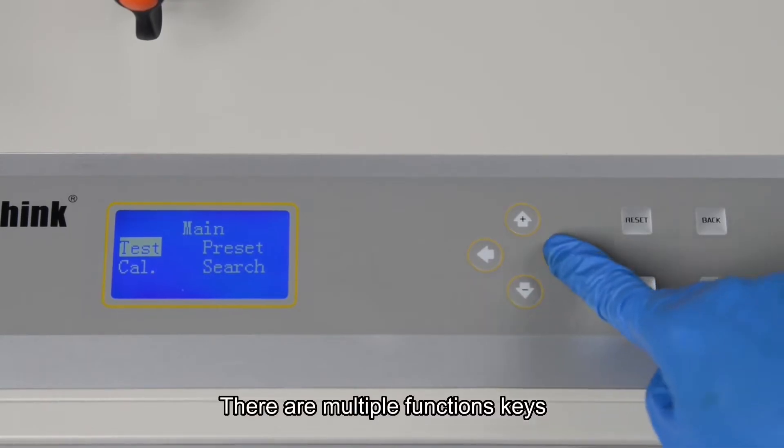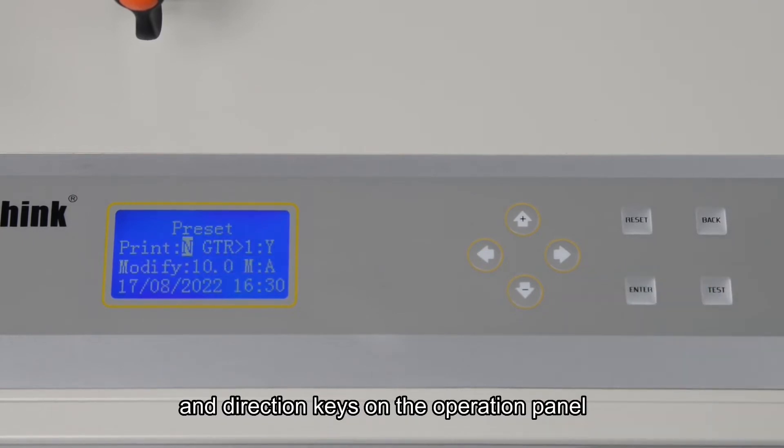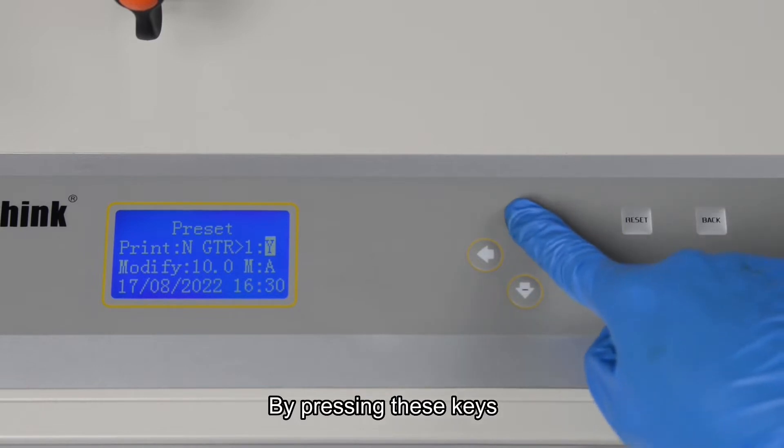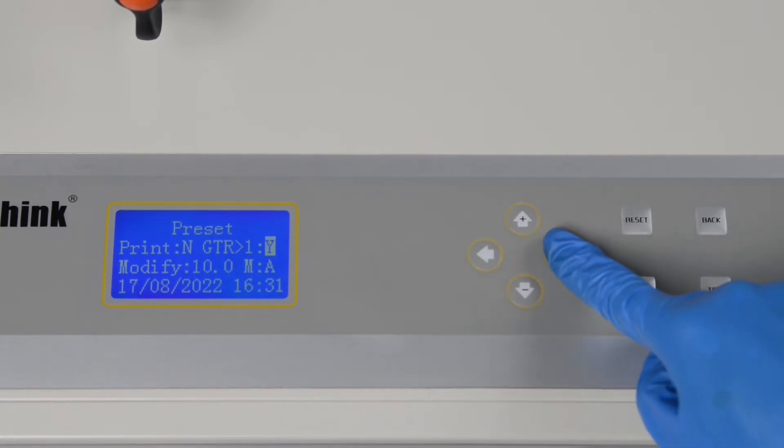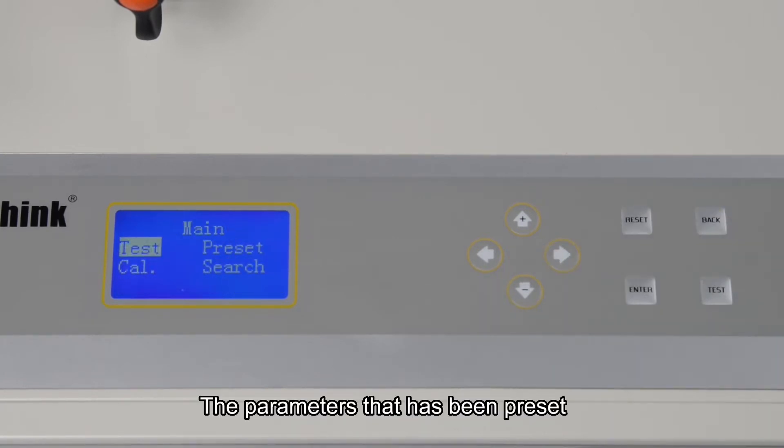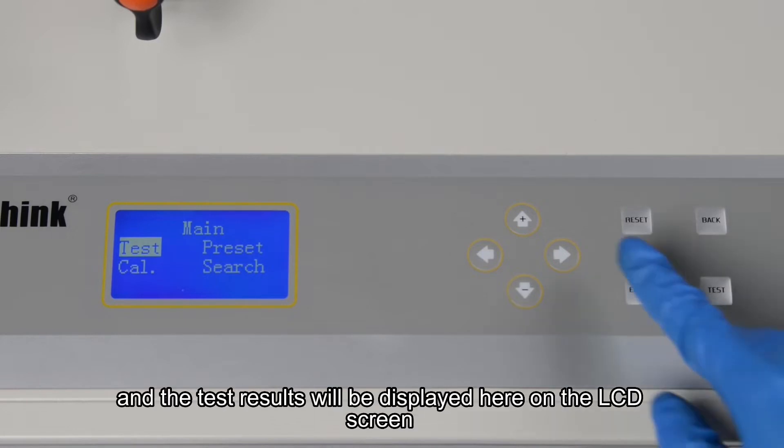There are multiple function keys and direction keys on the operation panel. By pressing these keys, we can start or stop the test, preset the parameters, conduct calibration, and so on. The parameters that have been preset and the test results will be displayed here on the LCD screen.